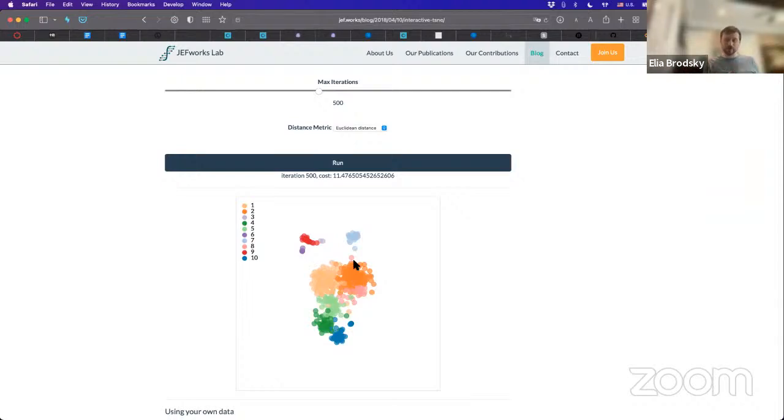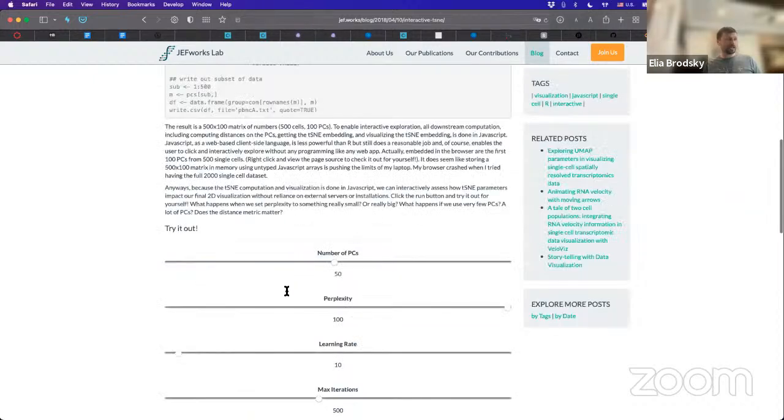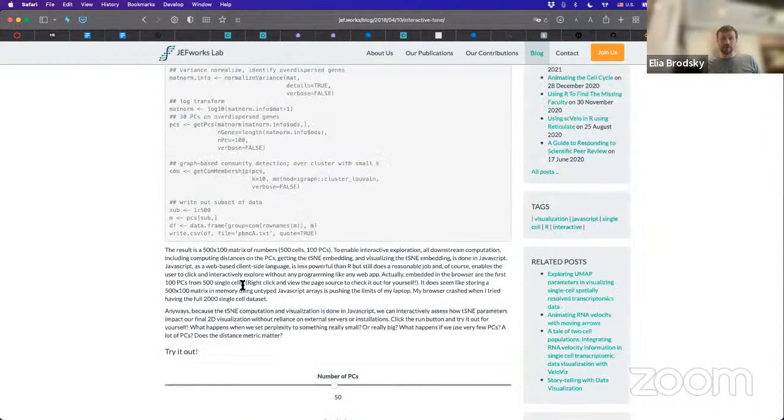You need to have controls. You need to understand your data. In many cases, they're artifacts, and learning about the methods themselves and playing around with these parameters helps you understand this specific data set. This is not just synthetic data anymore. We are now going to discover how these parameters work, and then you can apply them differently in different situations. That is what I want to be the outcome of today's session: that you understand that this is a promising technology that is developing rapidly, and we need to understand the methods of analysis in detail to be able to apply them correctly.